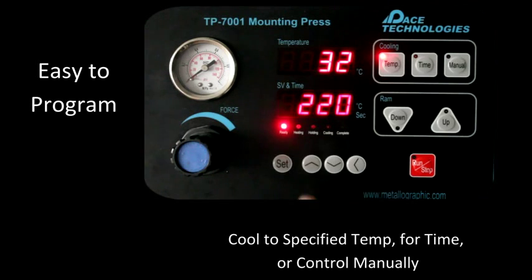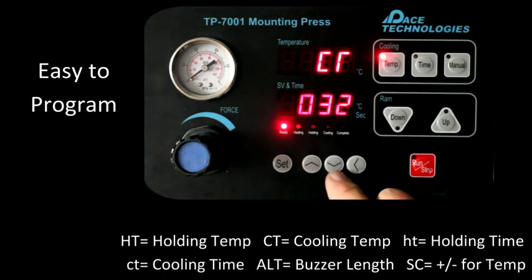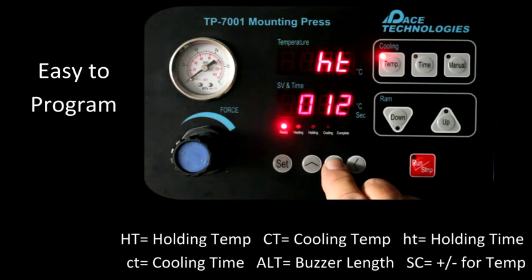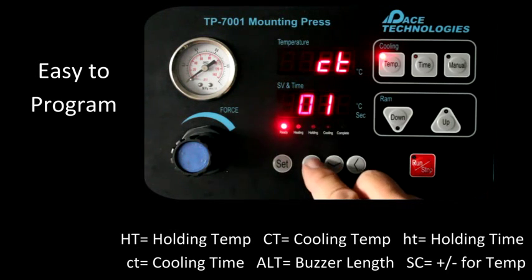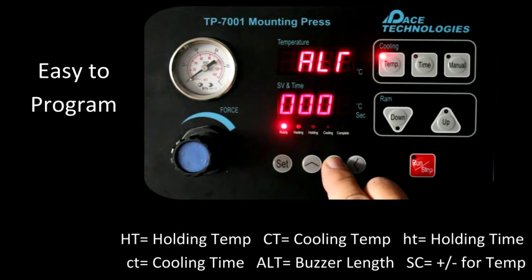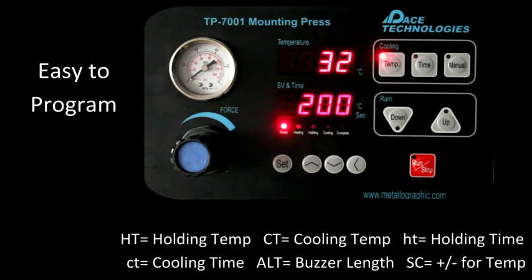To program the TeraPress, press the Set button. The first screen is the holding temperature — let's change that to 200 degrees. Press Set. Capital CT is the temperature the unit cools to when selected. HT is the holding time when the temperature is reached — let's change that to 10 minutes. Lowercase CT is the time if the time button is selected for cooling. ALT is the length of time the buzzer will sound. SC is the hysteresis of the heating cycle.